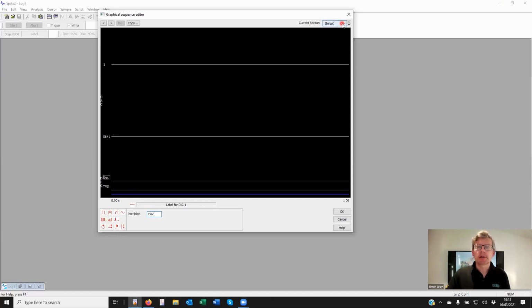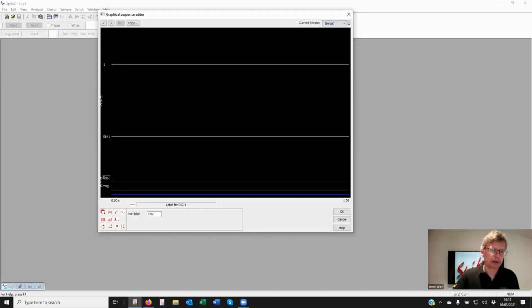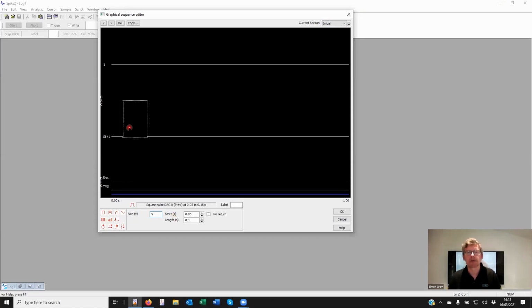I mentioned 27 output sections: 26 labeled A through Z, and initial. Initial is special. It runs as soon as we start sampling. So if you really do want to have a stimulus output to your prep at time 0, or very close to time 0, initial is the way to do it.